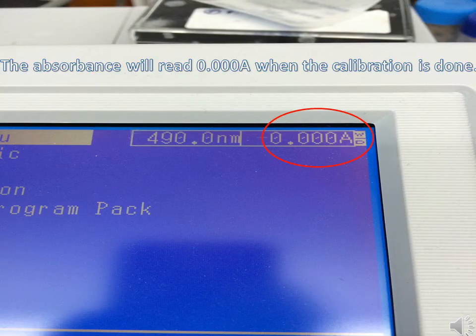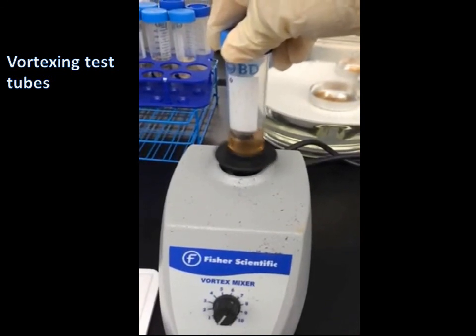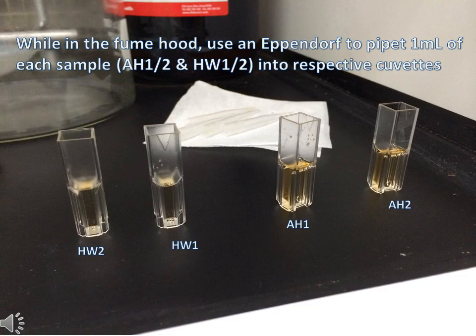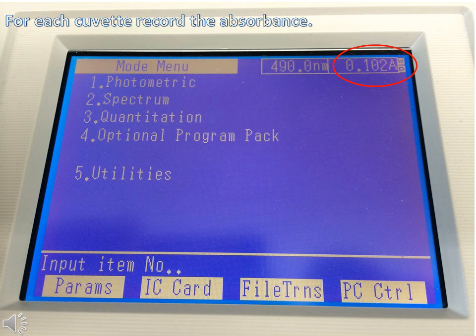Before transferring any of your samples to cuvettes, use a vortex mixer to properly mix all of your samples. While in the fume hood, use an Eppendorf pipette to pipette 1 milliliter of each sample into respective cuvettes. Do the same for the glucose standard solution test tubes. If not using disposable cuvettes, you need to wash them out with DI water and then coat the cuvette with the next solution before filling it and reading the absorbance. For each cuvette, allow the machine to reach a steady reading and then record the absorbance.